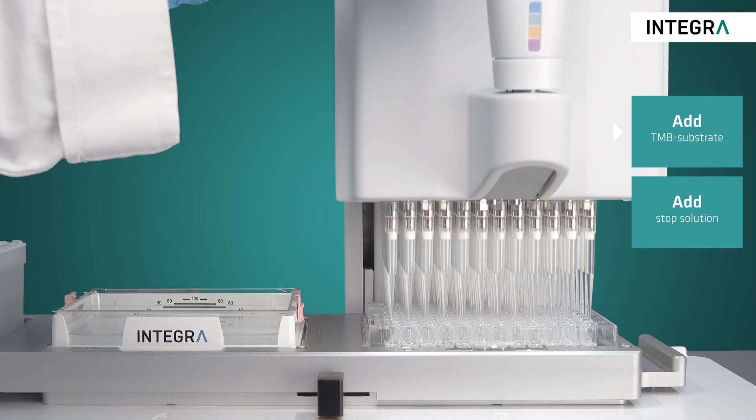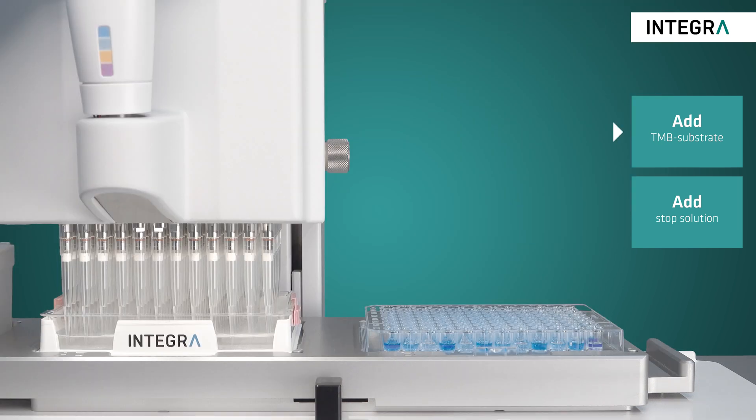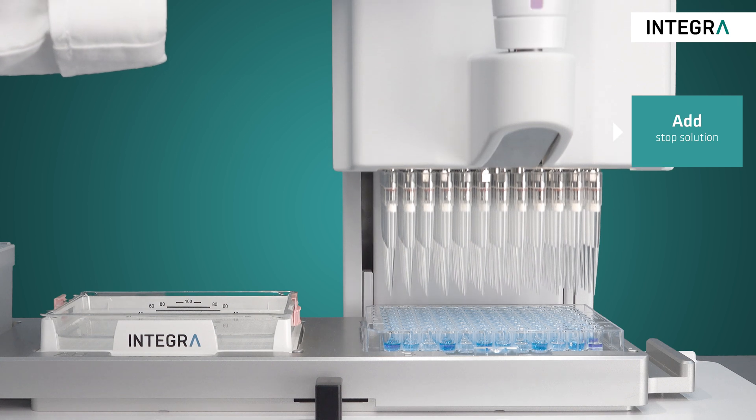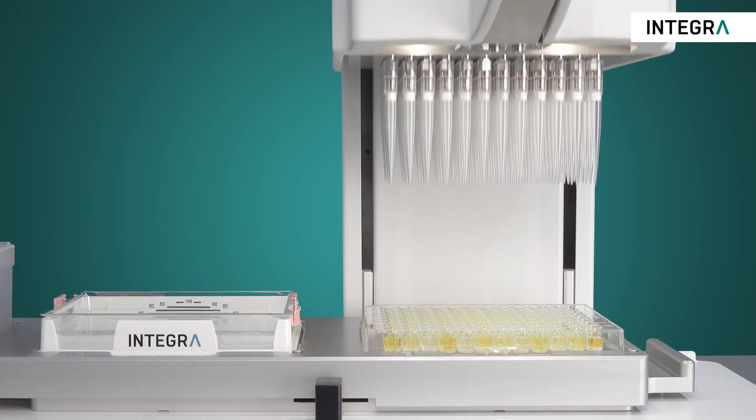All that's now left is to transfer the substrate from the reservoir to the ELISA plate. After sufficient color development, a great feature of the ViaFlow 96 is adding the stop solution simultaneously to all wells in the plate. And now the plate is ready for detection.